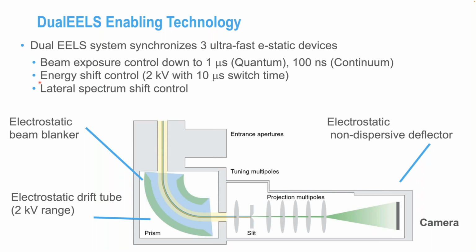These 3 elements work as a single unified system, and it's controlled with fast FPGA programmable electronics. We need all 3 of these. They're greater than the sum of their parts. It's a unified system with these 3 components. So that's the hardware in the spectrometer.